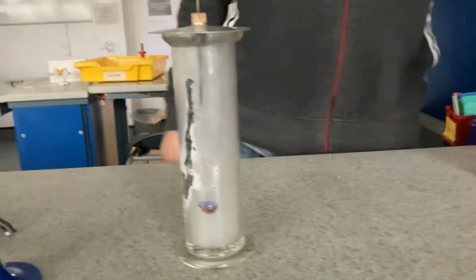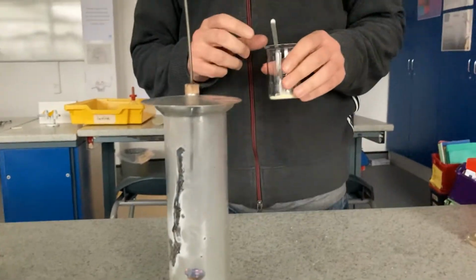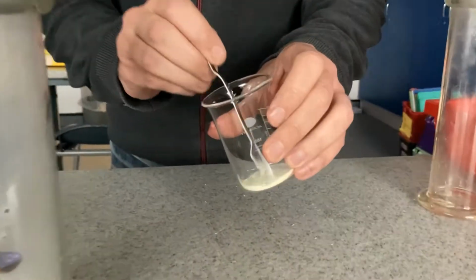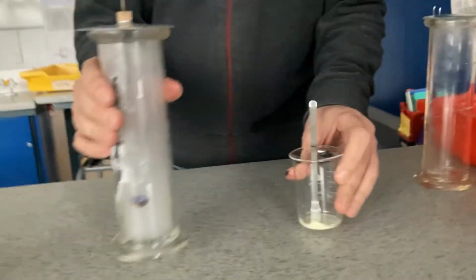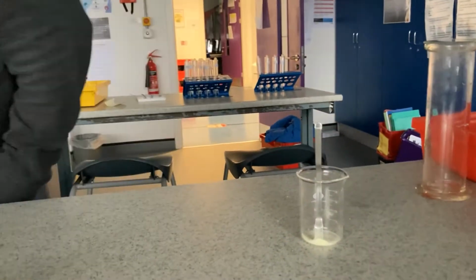And I think that's it. We've got no more metals. We do have this one here actually. This is sulfur. It's not a metal, but it does look quite good when it burns. So I guess we should burn it really. It'd be rude not to.